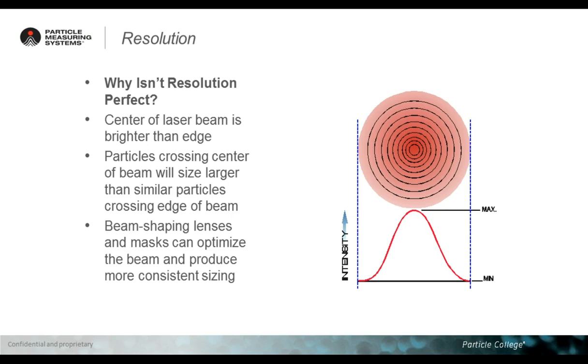Current technology allows us to minimize the effect of this and also helps maximize the performance of the laser diode by employing different lenses, which increase the focus of the laser and adjust its orientation. But just to say that one of the factors that may affect your resolution performance is, of course, the laser beam.